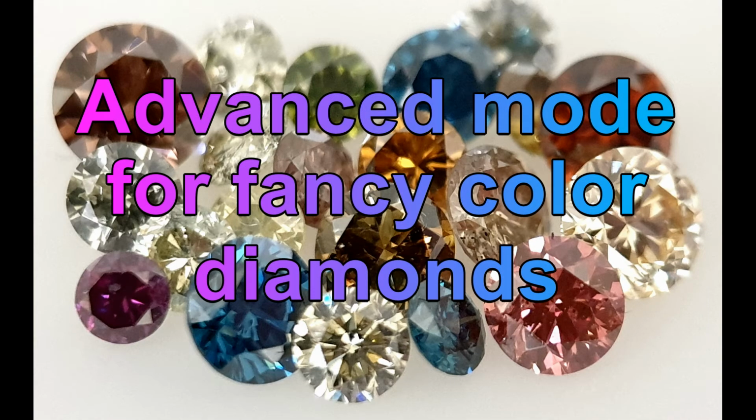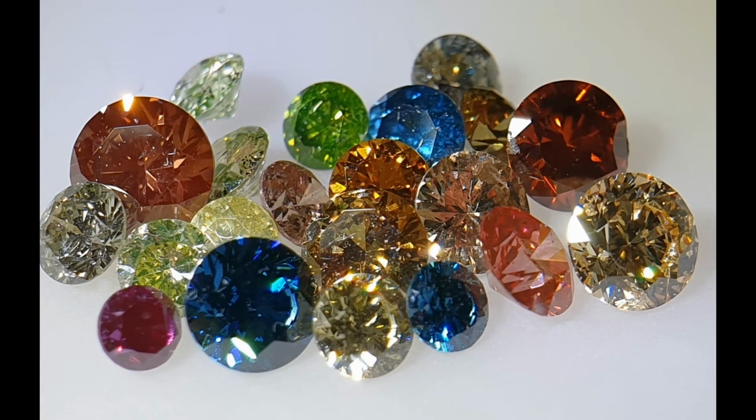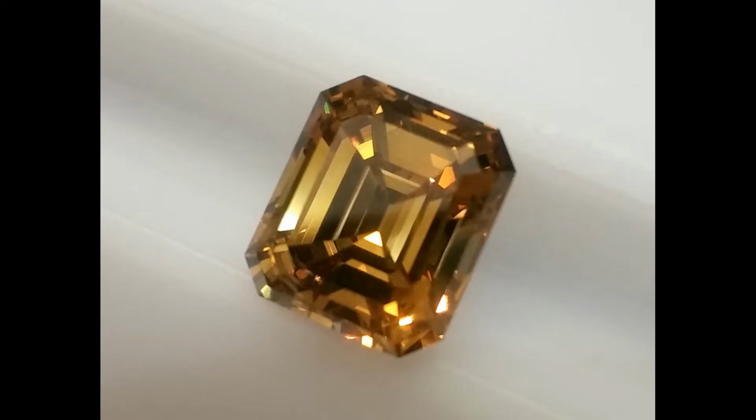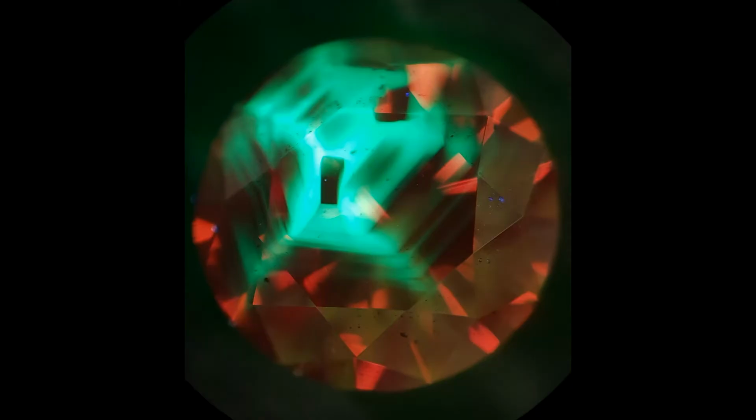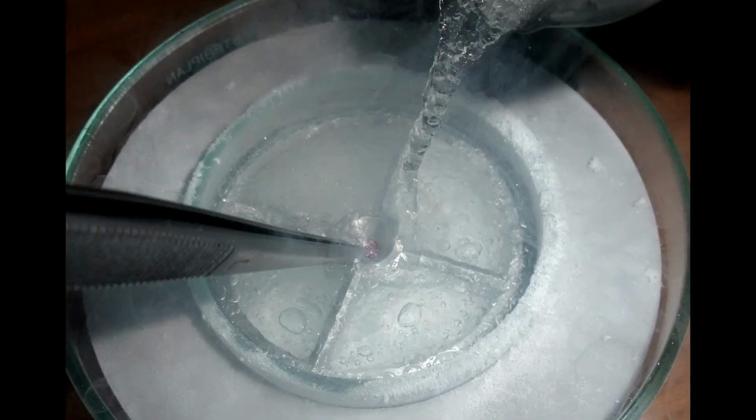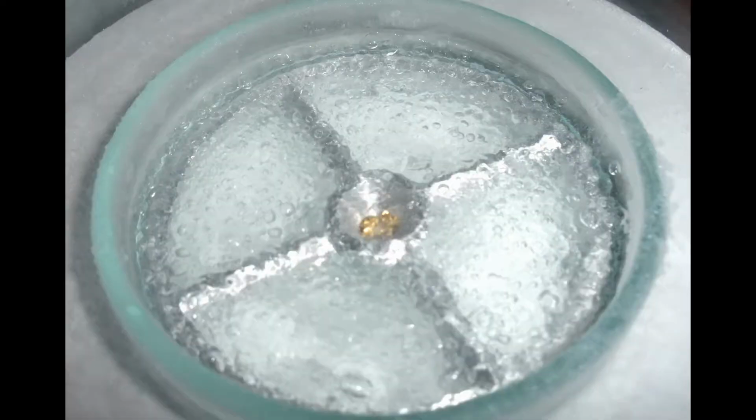Advanced mode for fancy color diamonds. Analysis of fancy color diamonds is one of the most complicated tasks in the gemological laboratory. The value of these stones is so high that a huge wealth of resources are today invested in the development of treatments and synthetics. Besides classical gemological methods, it involves a number of spectroscopic techniques which, in some cases, can sometimes be inconclusive. This is the reason why we should consider each color as a separate issue.